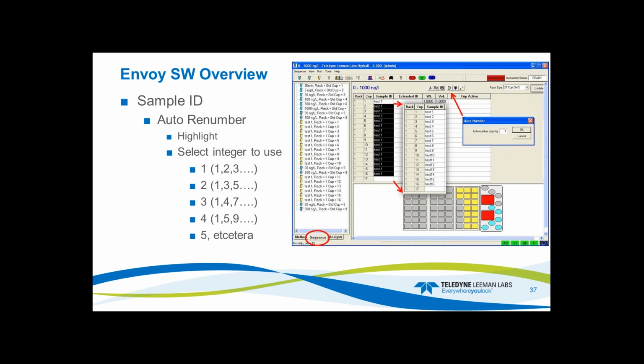To do the fill down, you just highlight the cell that you want, and then keep your left mouse click down and drag it down, and it'll highlight those boxes, and then it'll fill it in. Same thing for cut and paste and copy to clipboard. And those are all the features right up here on these little menu buttons.